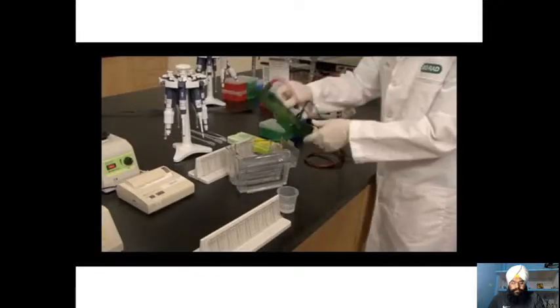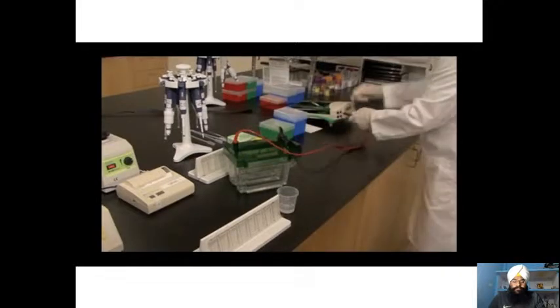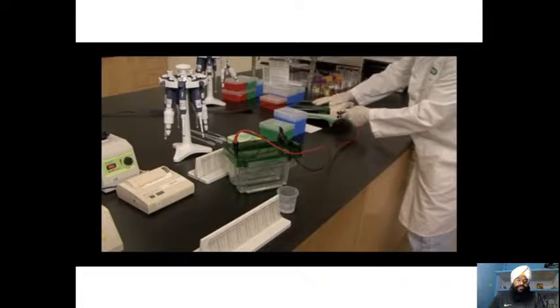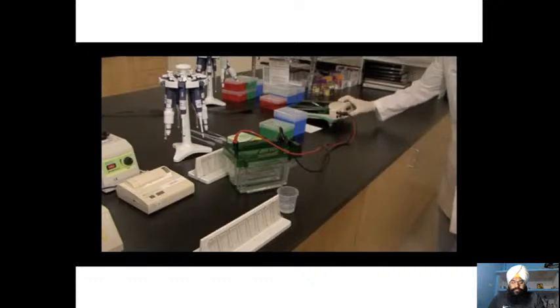Place the lid onto the Criterion cell. Insert the leads into your power supply. Program for 200 volts for 1 hour, constant voltage. And start.